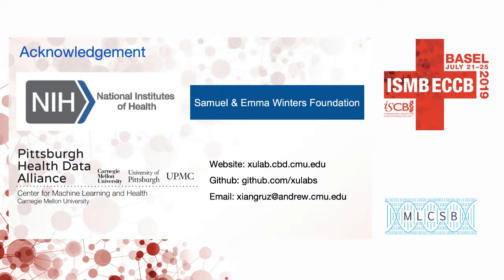It's a very good suggestion, and the rationale for this method is to reduce the annotation cost, because it may take several weeks to annotate, since you need to compare with the template at all rotations and translations, and it's very computationally intensive. And usually the training data set needs to be sufficiently large, maybe several times larger than the testing data set, to have a satisfactory performance, because of the noise and also the missing wedge effect, which causes image distortions.